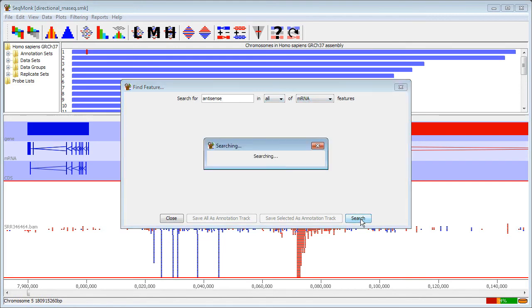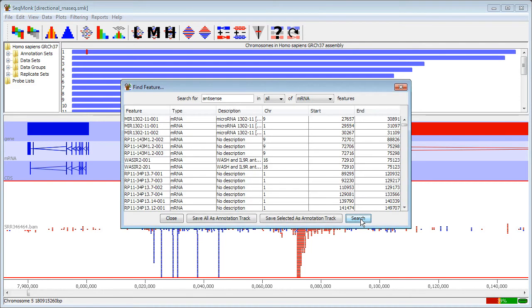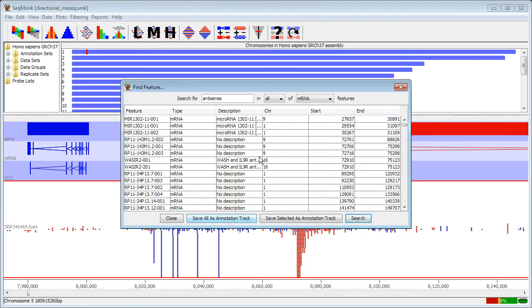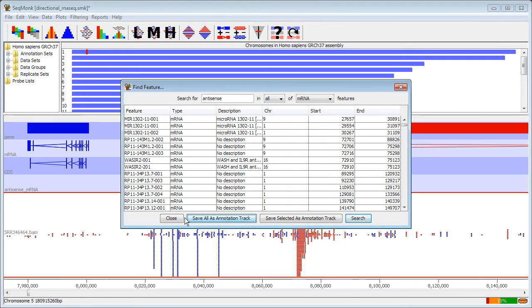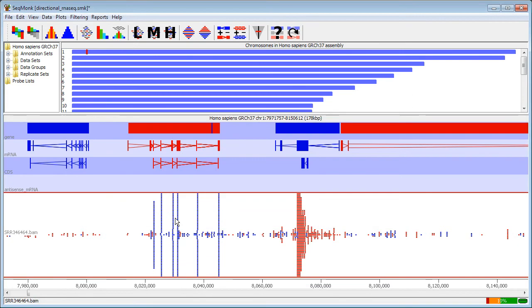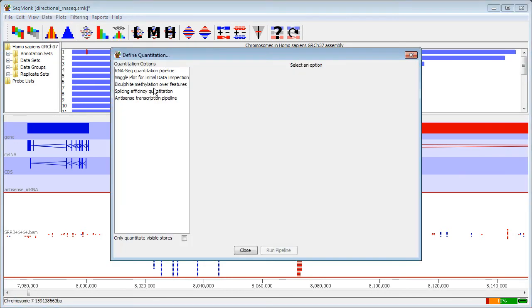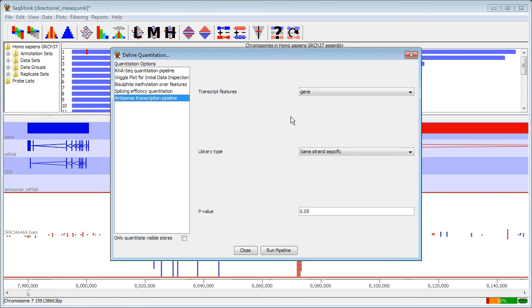This should give me a list of known antisense transcripts, and I'm going to save these in an annotation track so I can use them later. The antisense quantitation pipeline that we're going to use here requires that we specify a set of features that we're going to use. In this case we're going to analyze each gene separately.